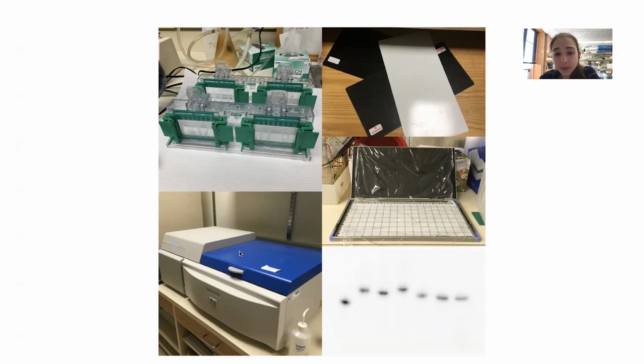Then when we put it in one of these scanners, it gives it the little boost it needs to give back that stored energy as light that the machine can then detect. So if we place one of these screens on top of our membrane, we can see bands appear where our thing was located.